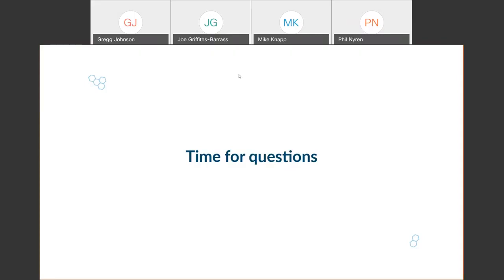I can take that one, Joe, if you like. Yep, by all means. So yeah, thanks for the question. I think we touched on this a little bit, both on one of the slides that I referred to and also Greg's summary. But peristaltic pumps are inherently low shear, just because of the mechanism that they use. The fact that you're propelling the fluid, whatever it happens to be, cell suspension or molecular suspension, through a piece of tubing. So there's no impeller, there's no gears, there's nothing that's mechanically impacting the fluid directly. And with that inherent low shear nature of the peristaltics, there are ways to optimize cell vitality, as it were, even more optimally.